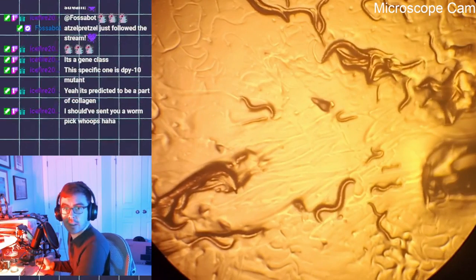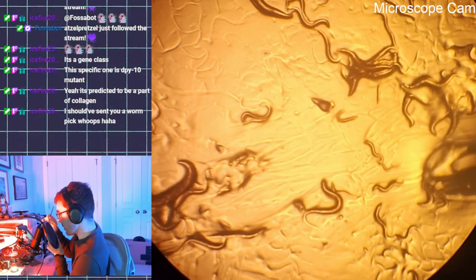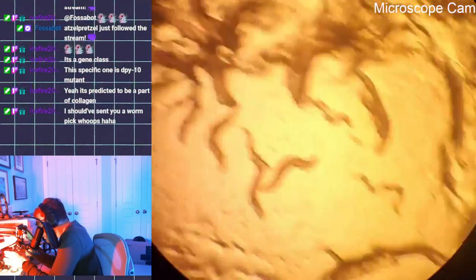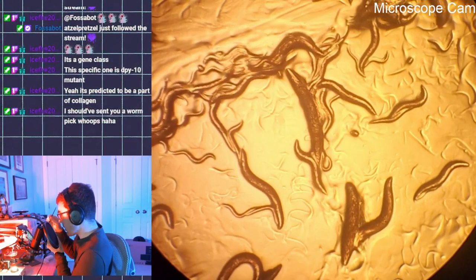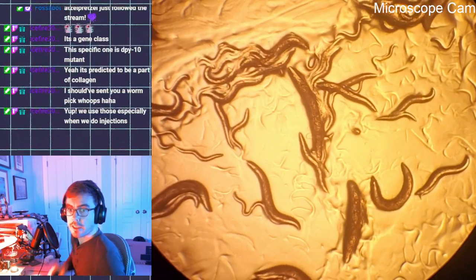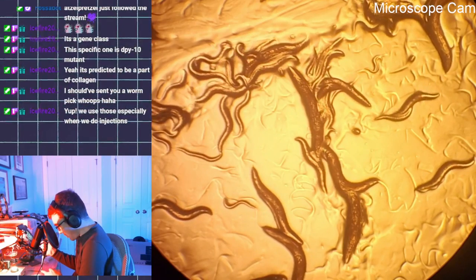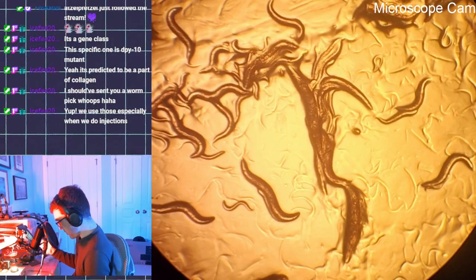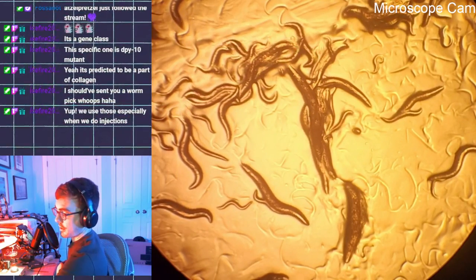All right, I must have a good set here. You should have sent me a worm pick. You described to me though, like I can make a worm pick with an eyelash, right? I just need to get enough on here so that when I put a little bit less sand down, a little bit of levamisole, that I won't lose them immediately. So that should paralyze them.